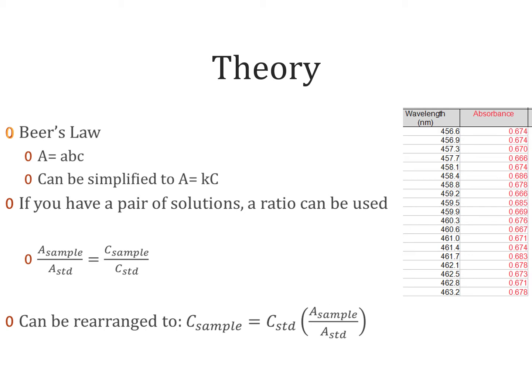And because we are interested more in the concentration value, we are going to use the ratio because we have a standard and we also have the samples at different concentration values in equilibrium. And that should help us to use this equation, concentration of our sample at equilibrium, and here this C value stands for the concentration of the product, the FeSCN 2+.